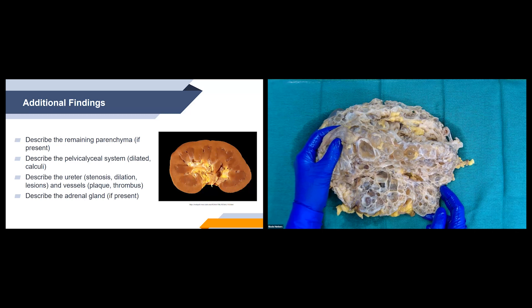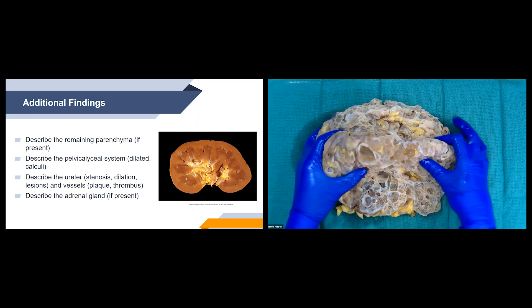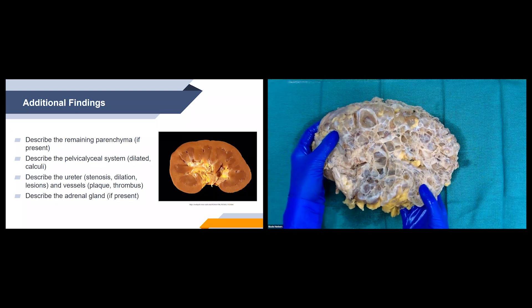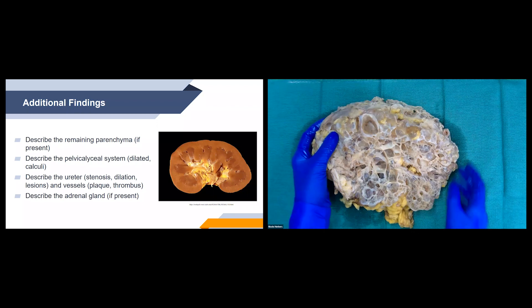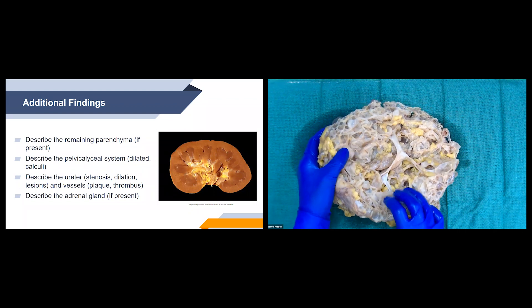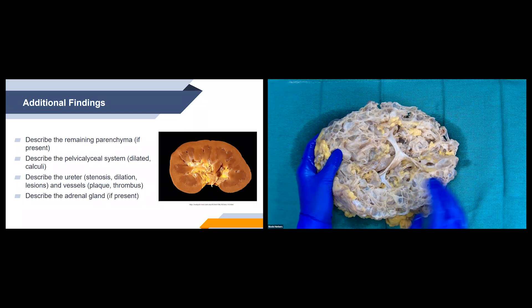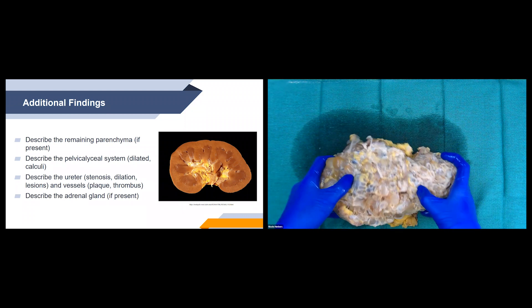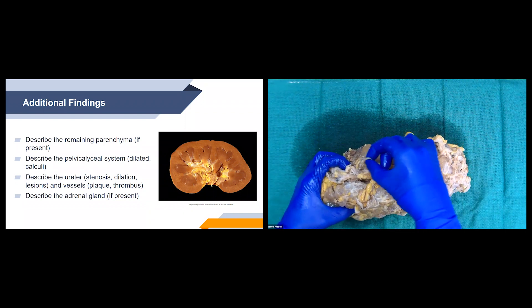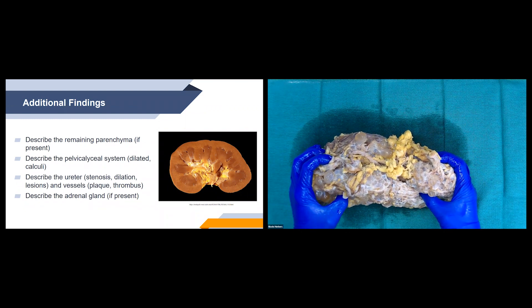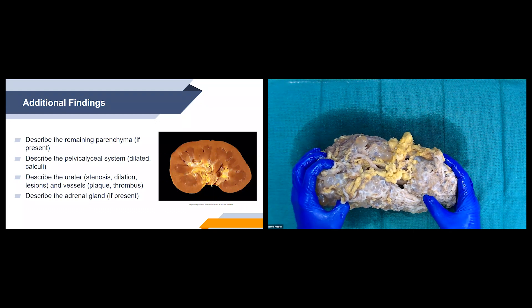For additional findings, we describe any remaining parenchyma if present — here's what normal kidney parenchyma looks like, and our specimen doesn't show anything resembling normal parenchyma. We also describe the pelvic calyceal system for dilation or calculi, the ureter for stenosis, dilation, or lesions, the vessels for plaques or thrombus, and the adrenal gland if present.